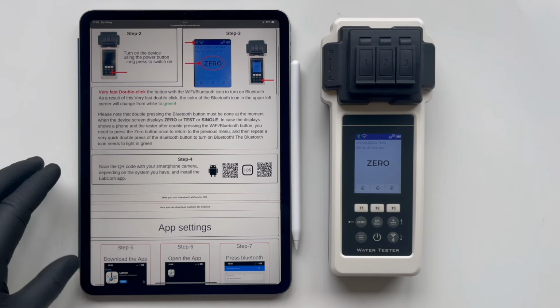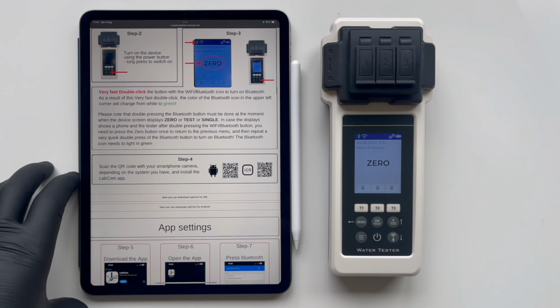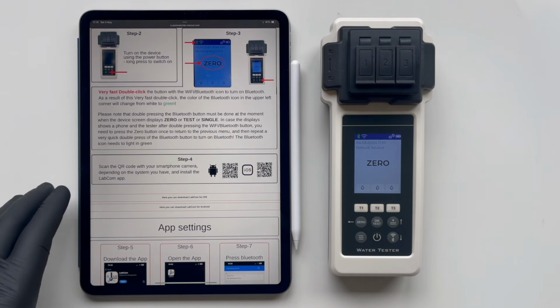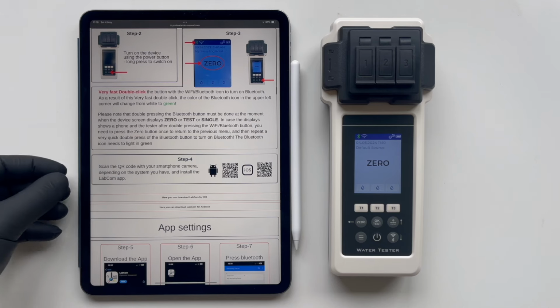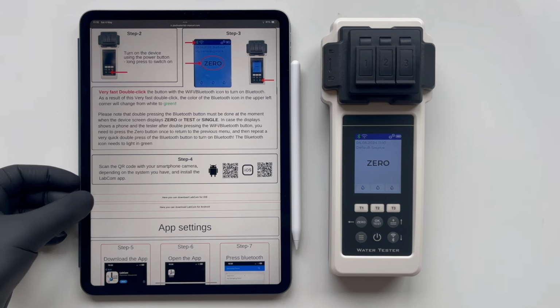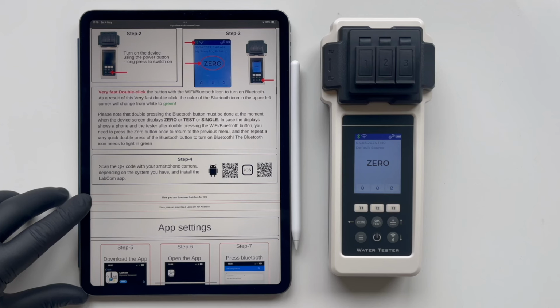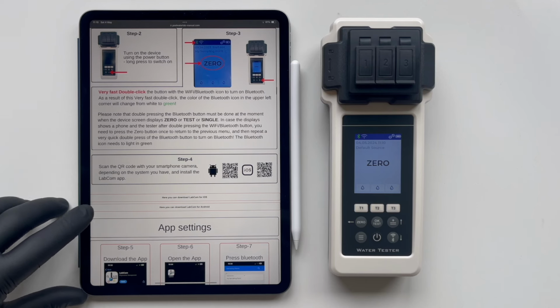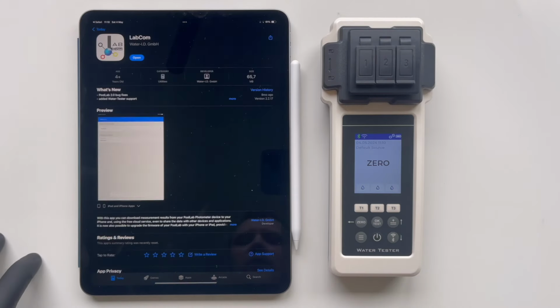After that, we move on to the fourth step. You need to install the LabCom app on your smartphone. At this step, you can either scan QR codes or follow the links provided. Simply by using your smartphone's camera to scan the QR code, the appropriate application page in the Google Play Store or iOS App Store will automatically open. Here you see two links, one for iOS systems and one for Android. We'll follow the iOS link, which takes us to the App Store.